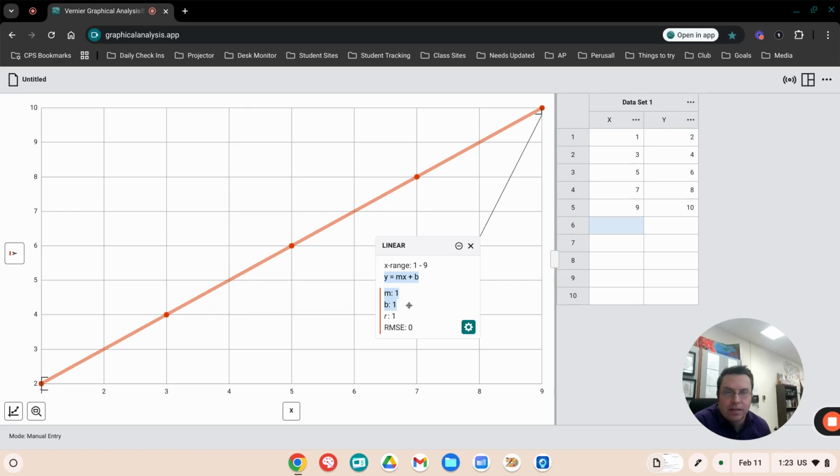And that's the rundown for this. Hopefully it doesn't give you guys too much trouble. Let me know.